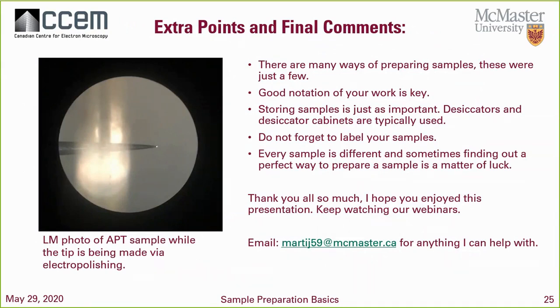Also, storing samples is extremely important. Desiccator cabinets, transportation tools like SCM boxes, or just anything that can help you transport your samples, because you want to make sure that you keep your sample away from all these air contaminants and hand contaminants.